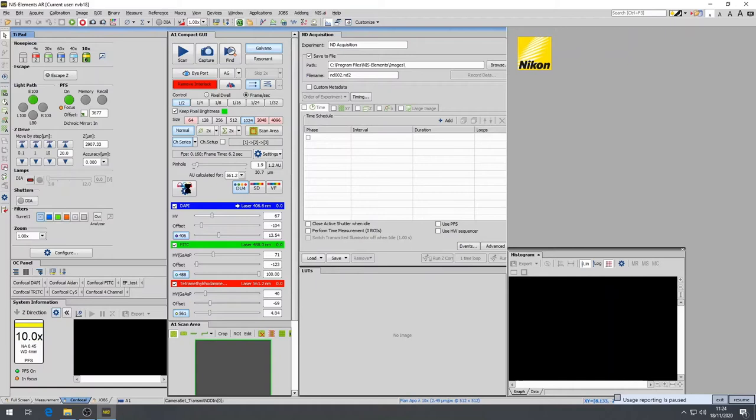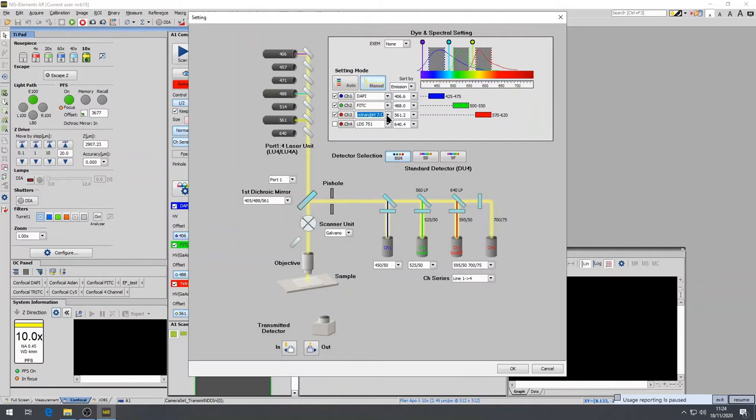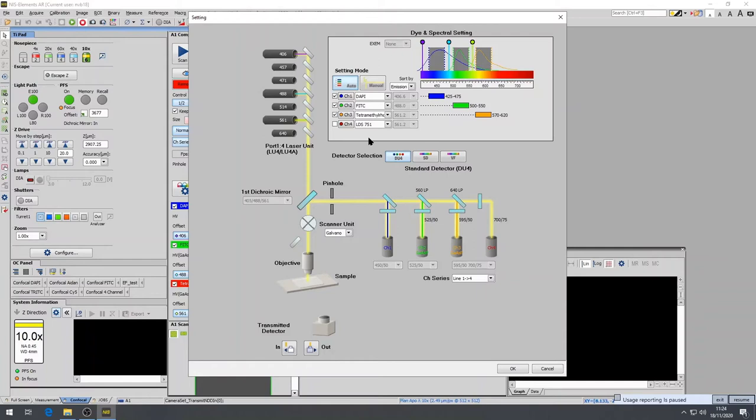A new window will open here. Using the drop-down menus, select your dyes. Channel 1 is usually the shorter wavelength and channel 4 is the longest wavelength dye. Select all the appropriate fluorophores that you used in your samples. It is also recommended to use the detector selection DU4 and the auto settings, which will input into the light path the correct dichroic mirror and emission filter for each respective dye selected.